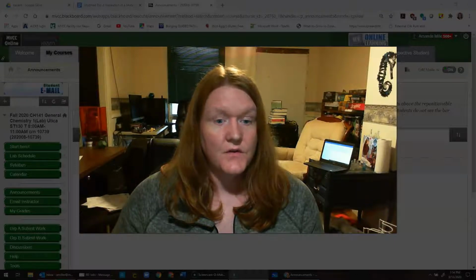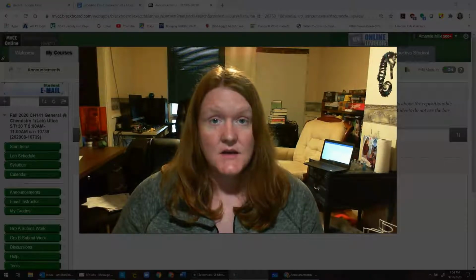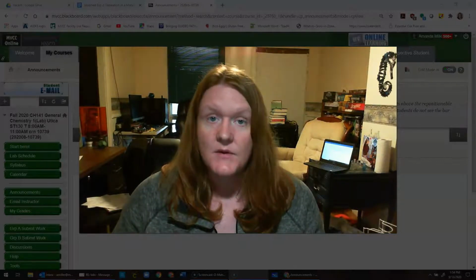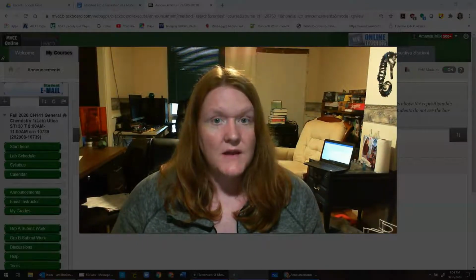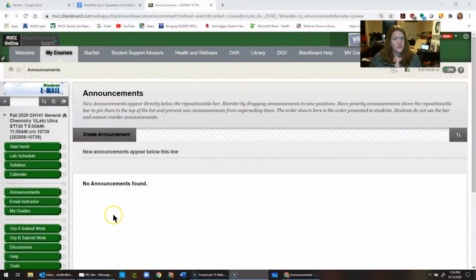So, first off, you are in person this week, so you are going to do experiment 3, which is all about measuring and learning how significant figures apply to science. These are universal skills. It doesn't really matter which discipline you're going to end up in, all of them apply significant figures in measurements. So, the way to be successful in this experiment is first off to find it in your lab Blackboard site so that you know what you're doing.